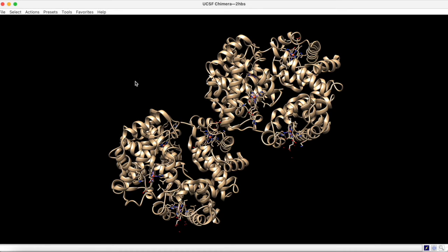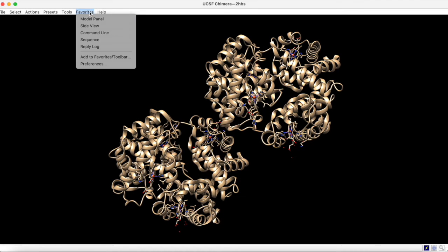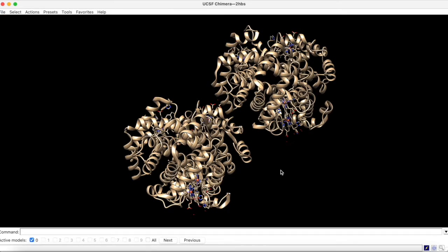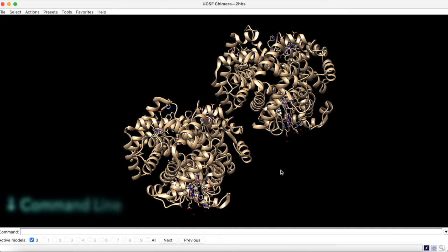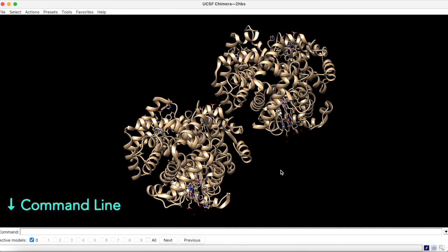Chimera's command line is readily accessible under the Favorites menu. Now we can use the command line to perform selections within the structure.